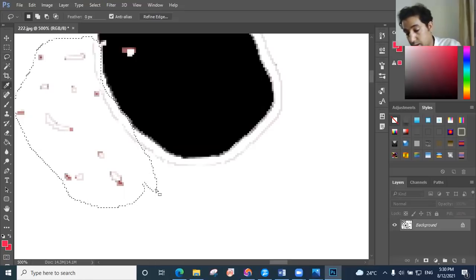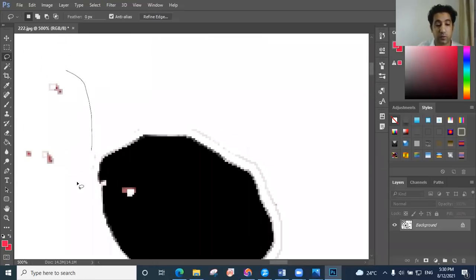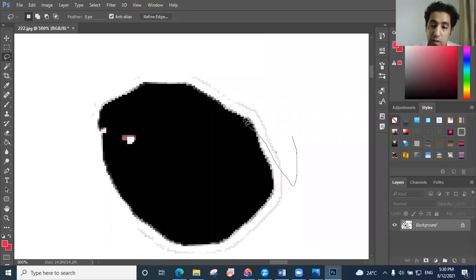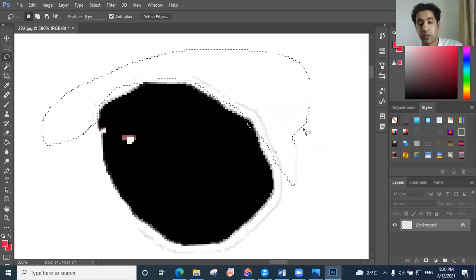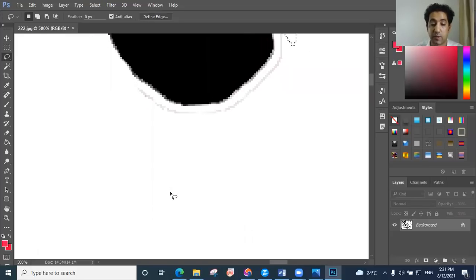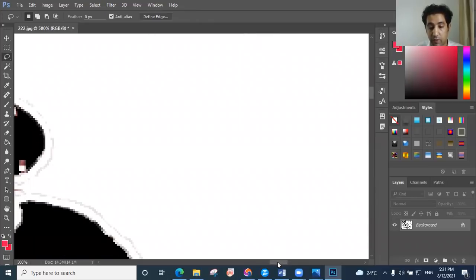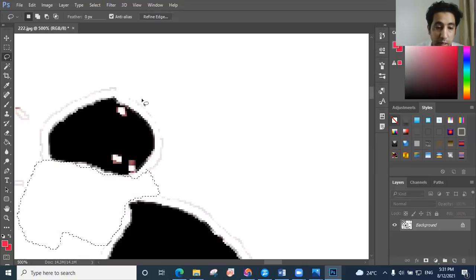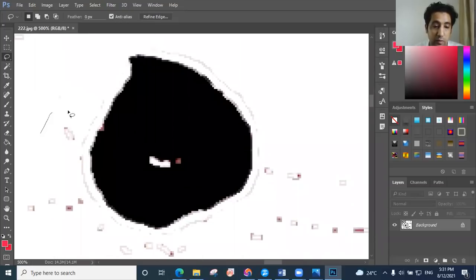Longer time and accurate and good result. Some people, they don't do this step, but they get wrong result because the app will calculate every dot in the pictures. We keep these dots. This line is okay. This, you don't need to clean it because the app will not determine it as a grain. But the ends of, or this place here between the grains, this must be clear because the app will determine it as grains, and the size will not be accurate.